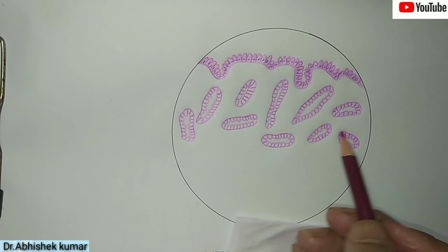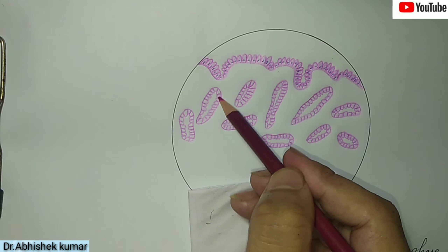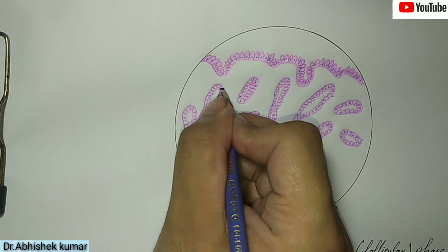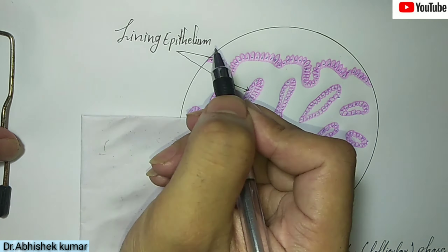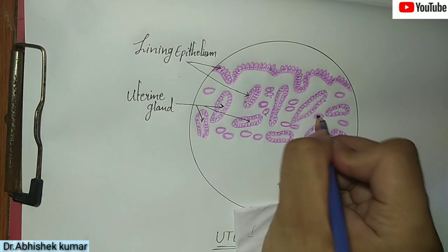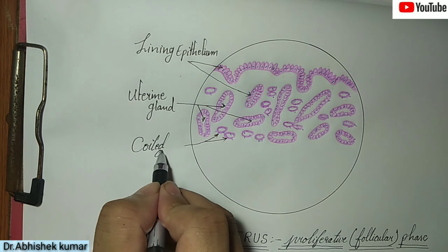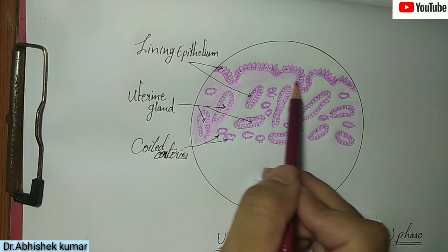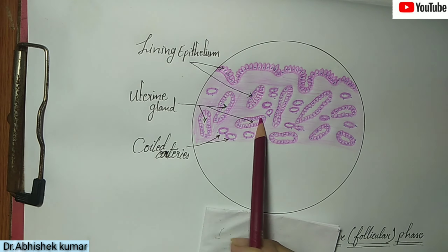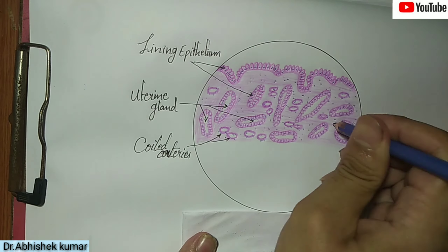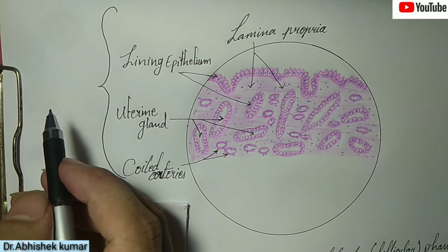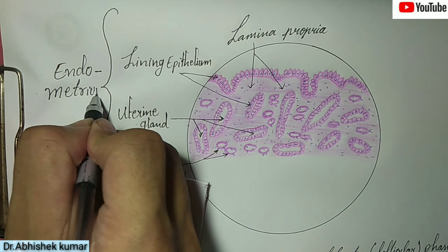We will label all the uterine glands — these form long tubular uterine glands. The lining epithelium extends down into the connective tissue of the lamina propria to form these long tubular uterine glands. These round circle structures are coiled arteries, mainly present in the deeper part of the endometrium. The lamina propria, lining epithelium, uterine glands, and arterioles together make up the endometrium.